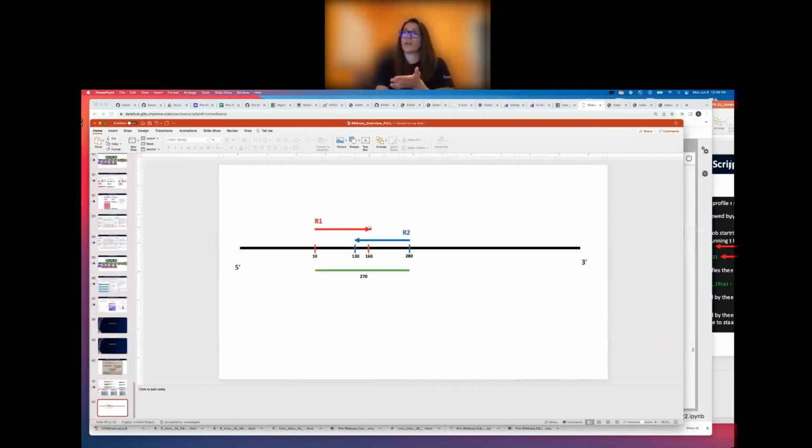So right now, all that we knew was the length of read 1, it being 150 base pairs. And it just so happens that read 2 in the example I used here is also 150 base pairs. But again, read 1 and read 2 length don't necessarily have to be the same. We just know that they go together because they have the same address.